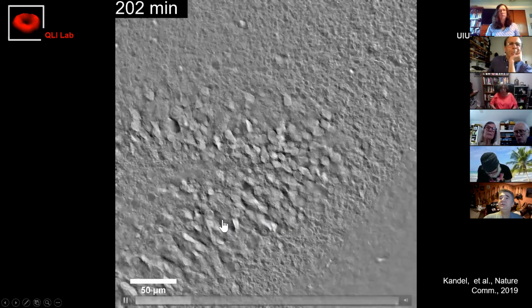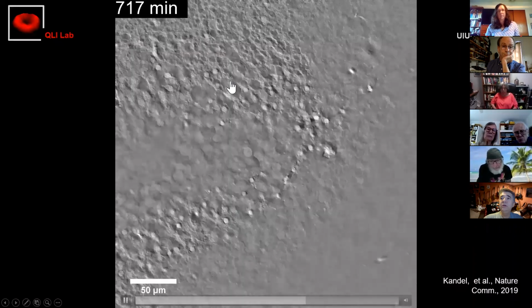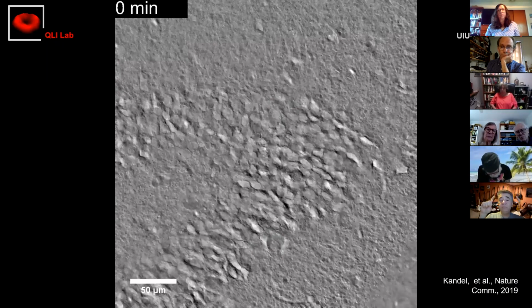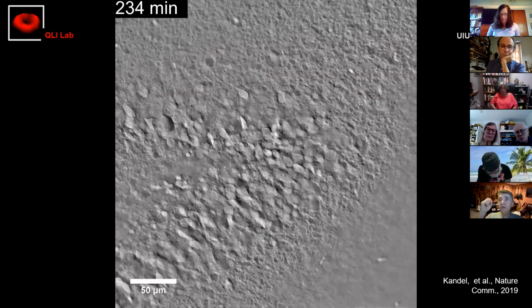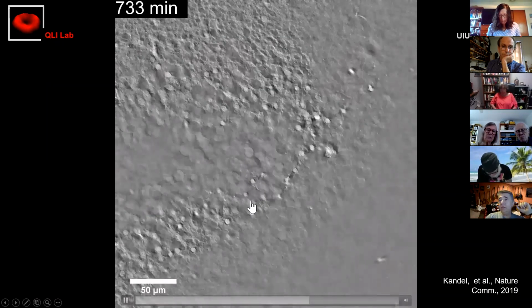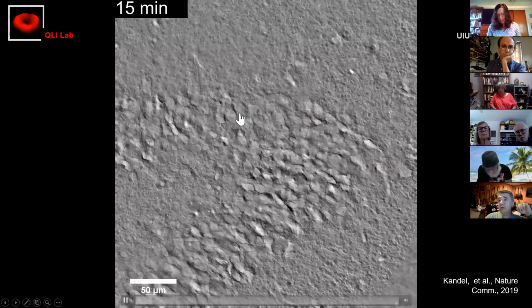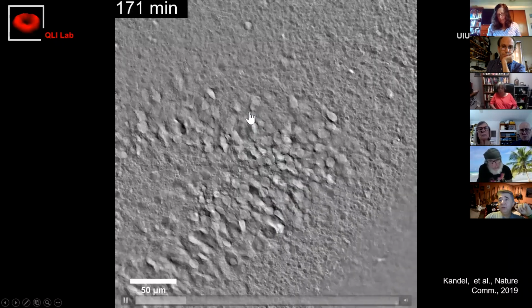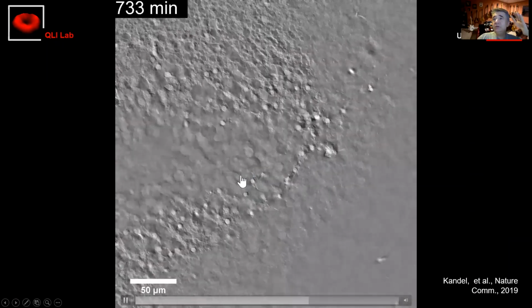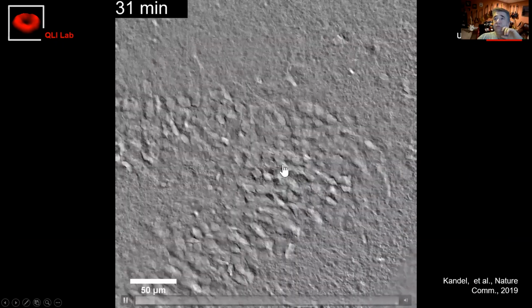So look at this. This is the brain slice I was telling you about, but now we're looking in reflection. So this could be much thicker now. So this slice could be kept alive much longer if it's thicker. And we go only from one side and we start to see these kind of beautiful dynamics here. And by the way, these are single cells. You can see kind of connections between the cells. And again, this is a hippocampus. So this becomes an interesting way to look at the brain slice, at least over a few hours.